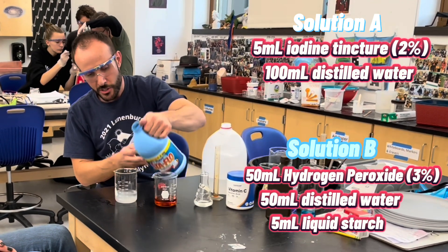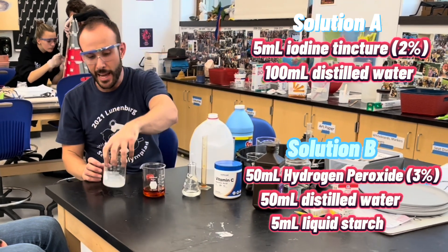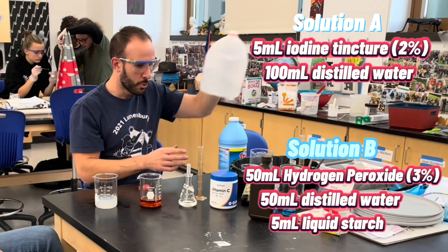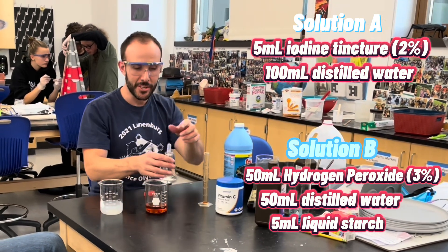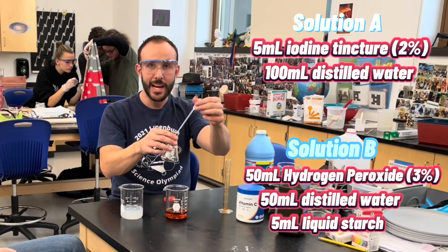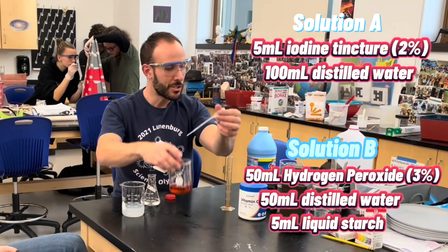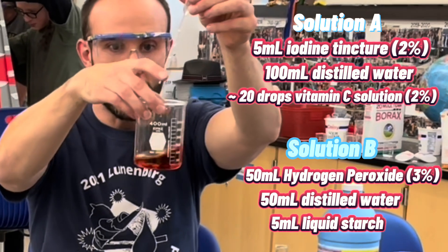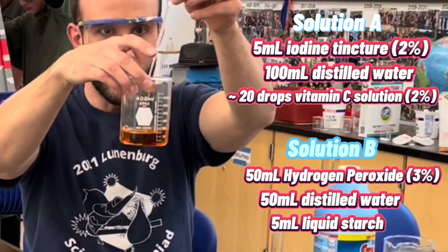The starch is going to react with the iodine, but we're going to put it on a delay, so it's going to react after a pause. The first cool thing about this reaction is the ascorbic acid — the vitamin C — will react with the iodine and it's going to make it go clear. So I'm going to put in some of the ascorbic acid, and the iodine is going to lose its color.